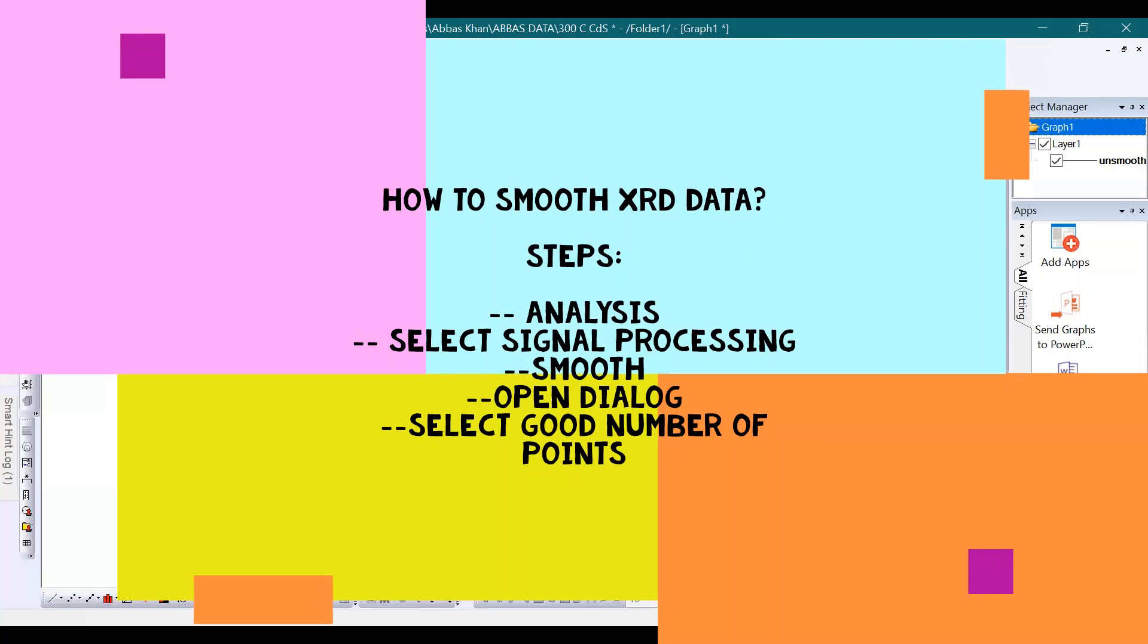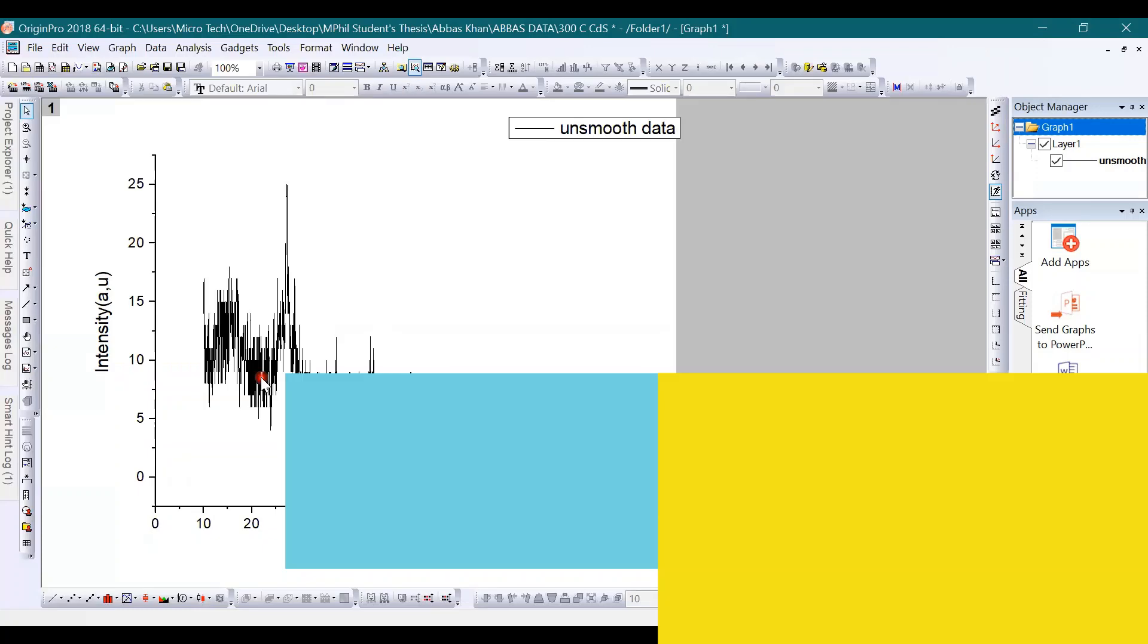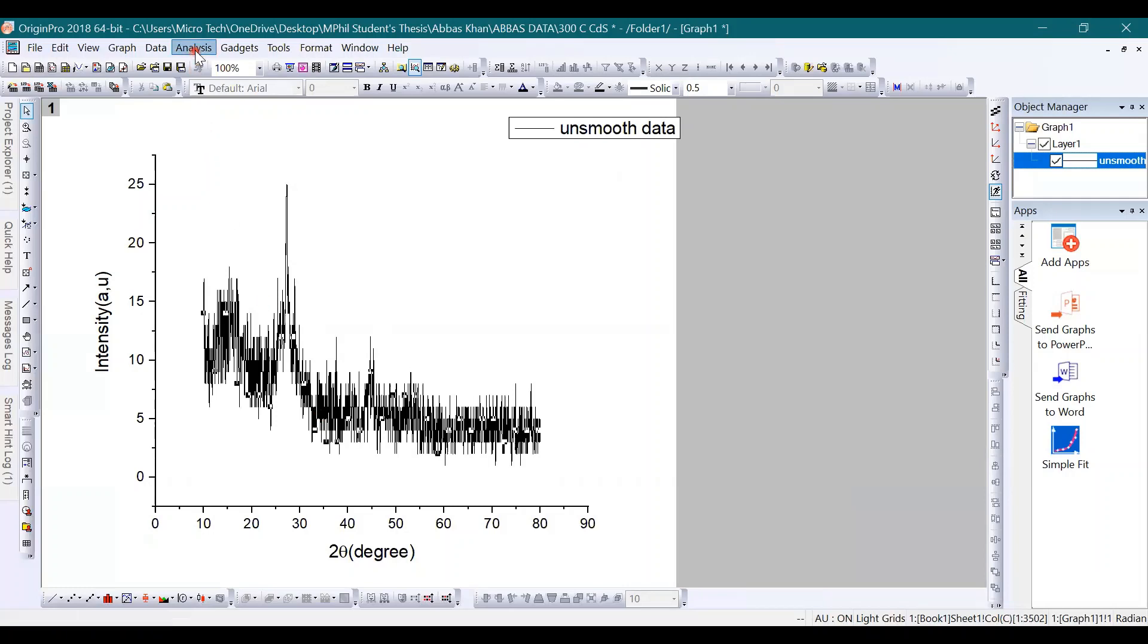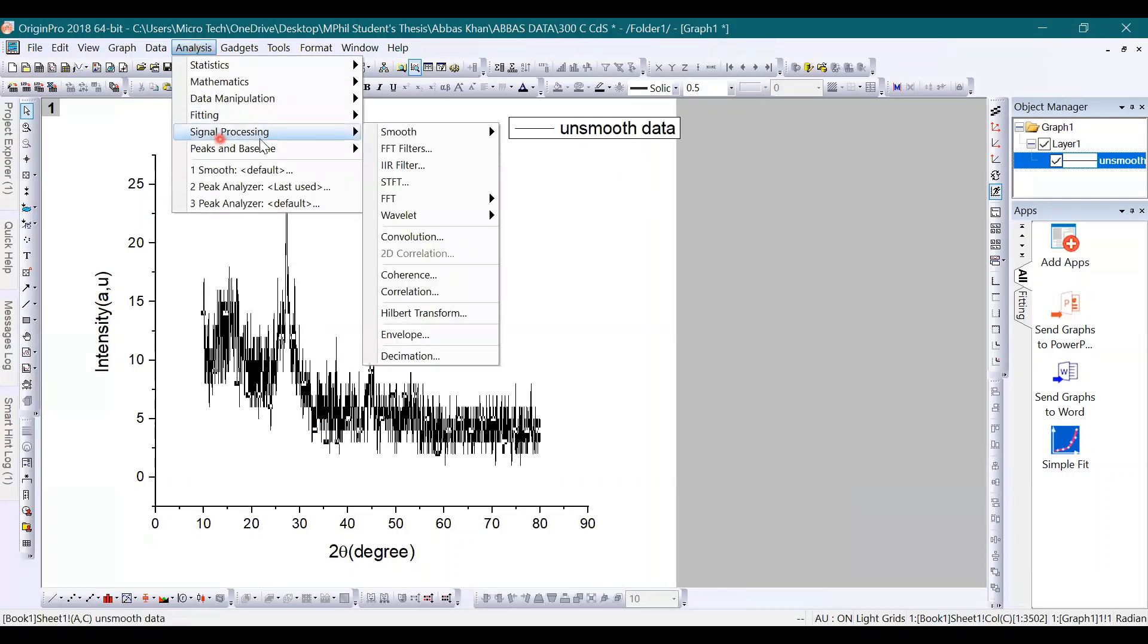I want to show you how to smooth your XRD data. Suppose we have XRD data here and we want to smooth it. For this, go to the Analysis option where you will select Signal Processing. Further, you will go through the Smooth option and then click on Open Dialog.